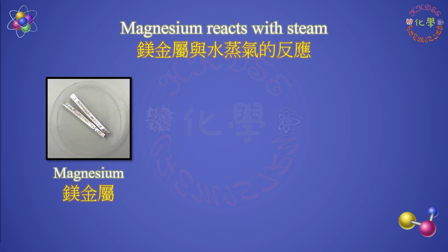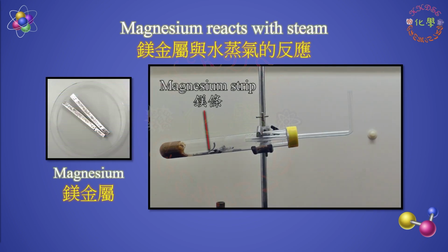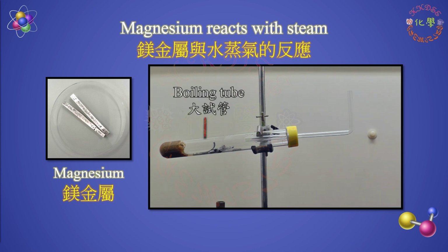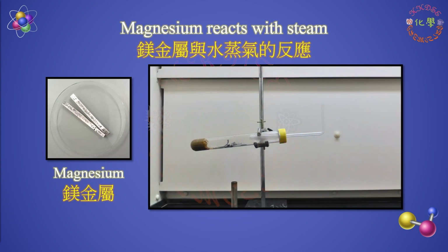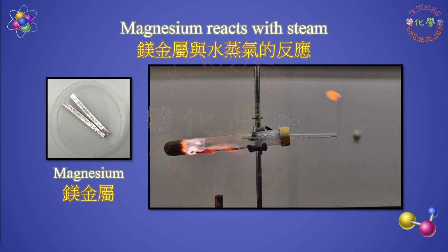Magnesium reacts with steam. First add the moist sand to the bottom of the boiling tube, then place the magnesium strip in the middle of the tube. Light the Bunsen burner and slowly use an igniter to ignite the released gas. The gas burns and turns fiery.